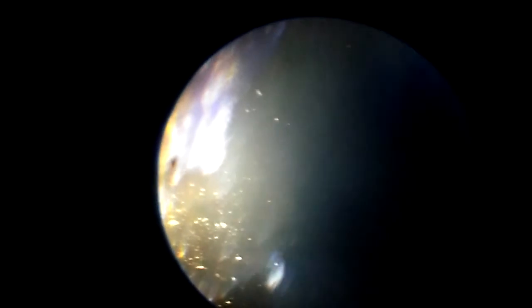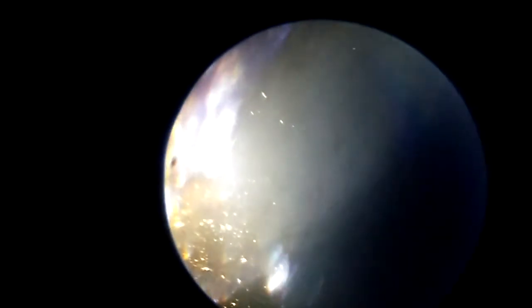The collenchyma tissue is also present along with parenchyma around it. The observation under the microscope is very good overall, though different focusing presents some problems. Let's continue examining these tissues and their arrangement in the leaf stalk of Carica papaya.